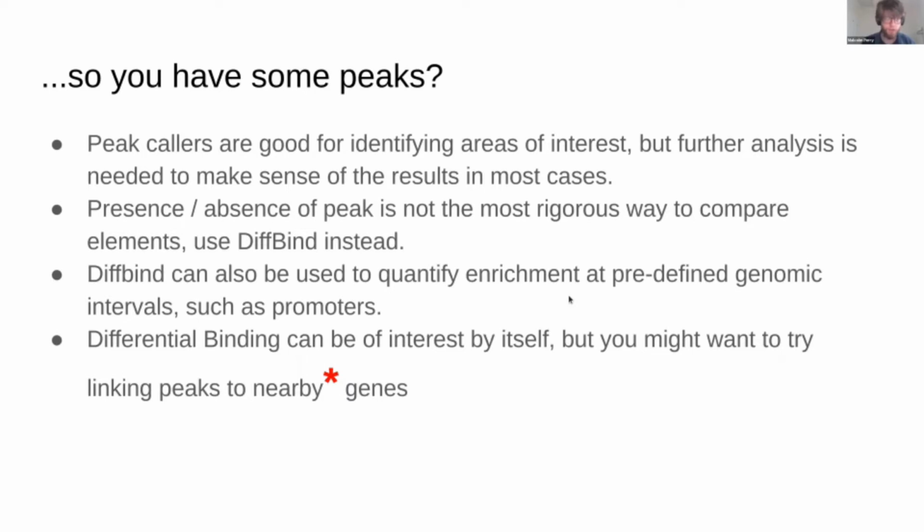I've put a big asterisk next to the next thing, and we'll cover it a bit at the end. You can use this kind of analysis to link peaks, or differentially bound peaks, to nearby genes, but there's a ton of caveats that come with that, and it's not a trivial thing to do. So we'll come back to that later.